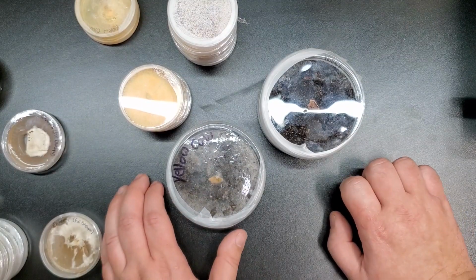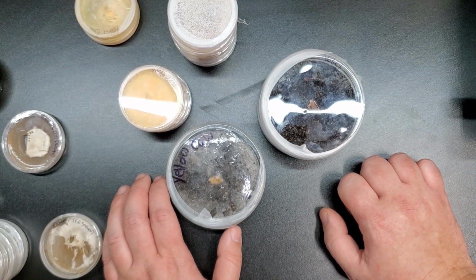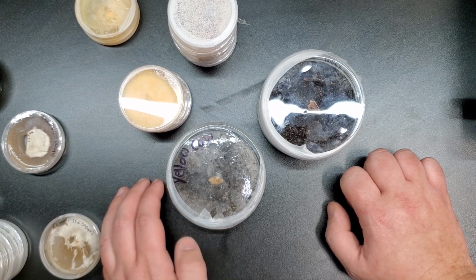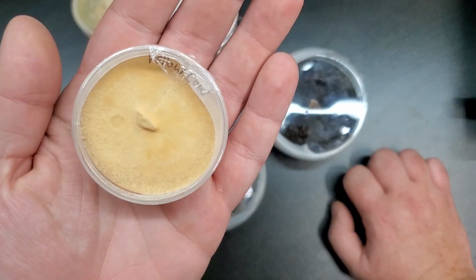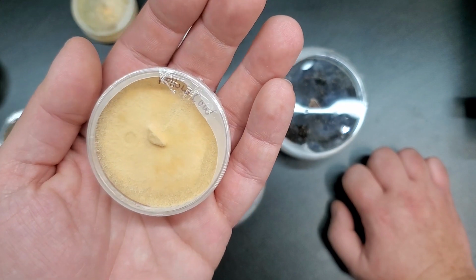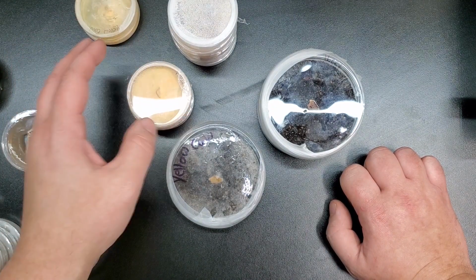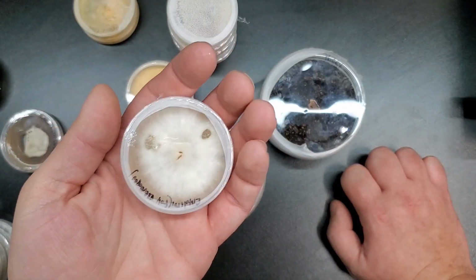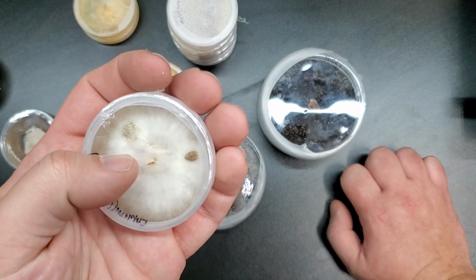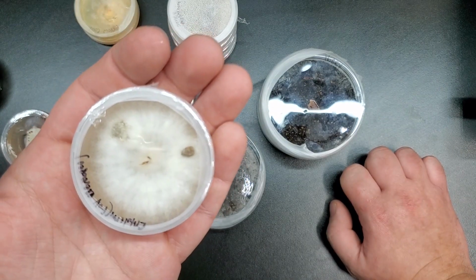So I'd say overall, this was actually a fairly large success. Everything turned out great. I didn't really have a whole lot of issues with these mushrooms. I can't really ask for anything better than this. It was really cool seeing them all grow, especially I really love the way that chicken of the woods mushrooms look on agar. And my phone's not doing a fantastic job of picking up the color, but this is a very brilliant orange color. It's a lot different than what I'm used to seeing with regular white mycelial growth. That being said, these are just really cool to look at too, because you have these white mycelial growth patterns, but then you have these really interesting nodules that just look like chicken of the woods but miniaturized.